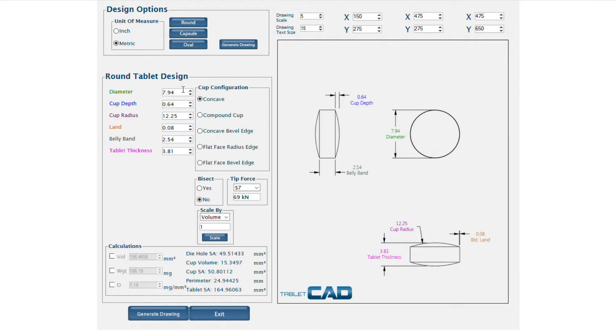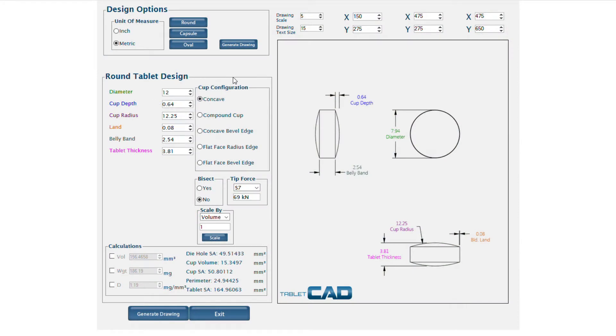Tablet CAD is extremely easy to use — no CAD experience necessary. An intuitive user interface guides you through the convenient design process with helpful tips and real-time validation.